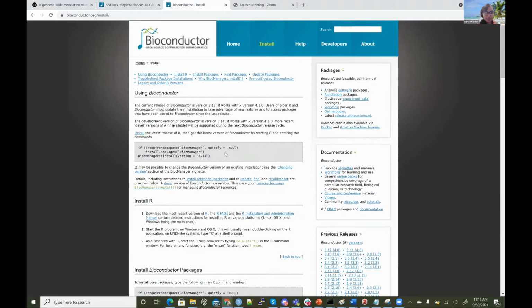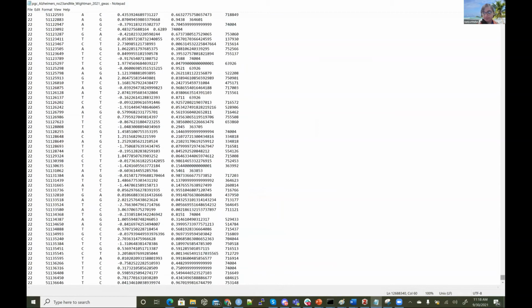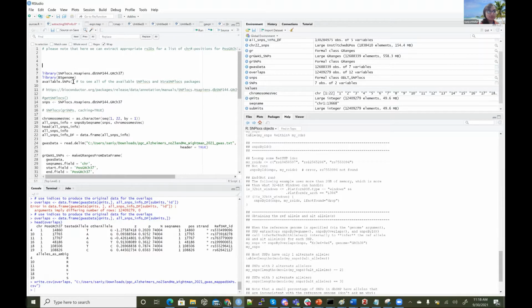Again, we want to look for the position in GRCh37. So I'm going to need you, as of now, to please just run this.